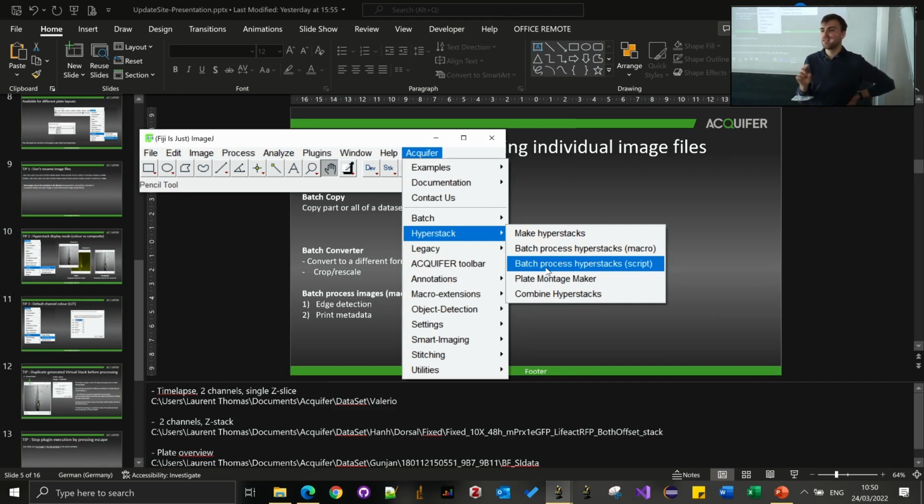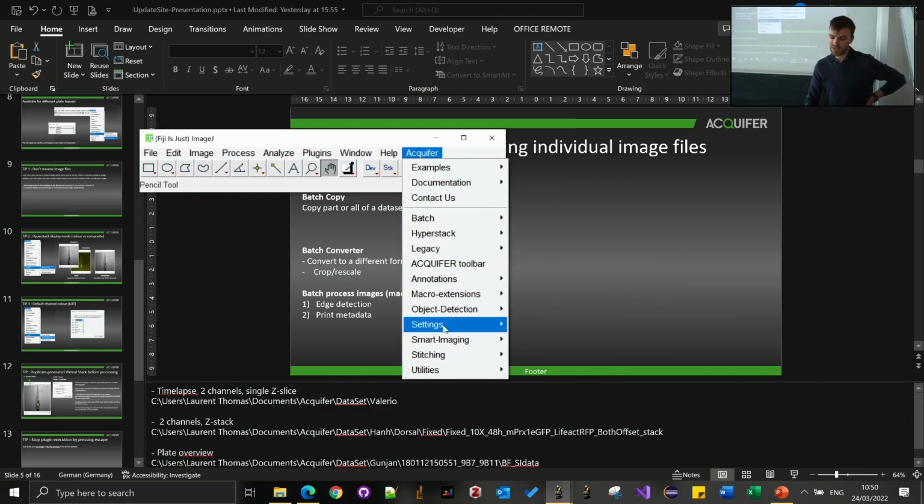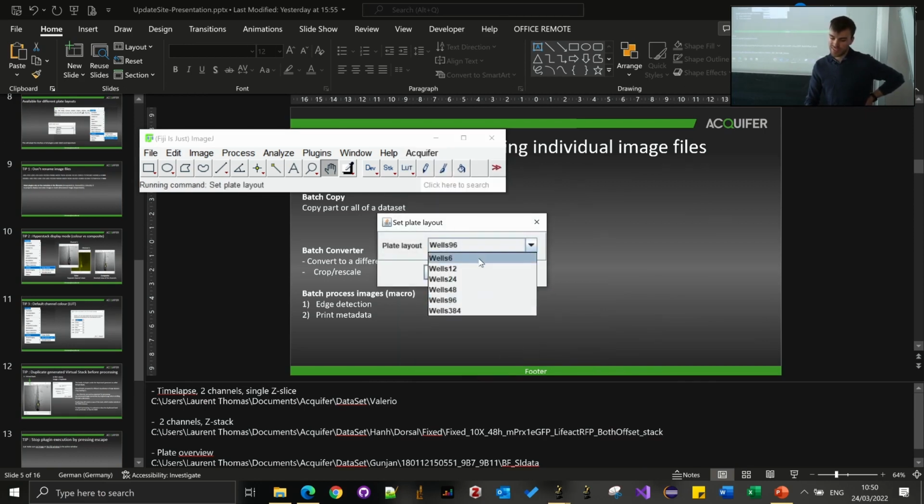I will need to see the files to see what well names the machine is giving them. It gives normal ones. We were doing, I don't know, 4x4, so it would say A, B, C, D and 1, 2, 3, 4. Oh, well, then it should work. But would it automatically recognize it as a plate layout, because it's not in the default ones? Yeah, true. You can basically go for the closest layout. So 6 is going to be 3 by 2. So you have 4 by 4.